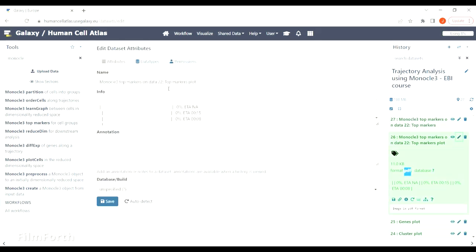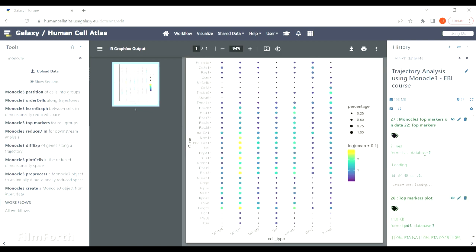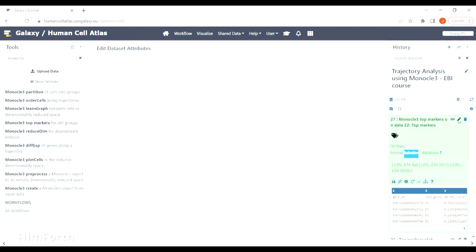There is a PDF file with a plot of the results and also a table which summarizes the results.